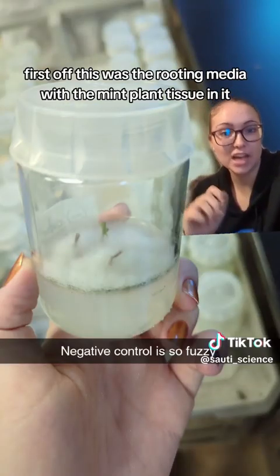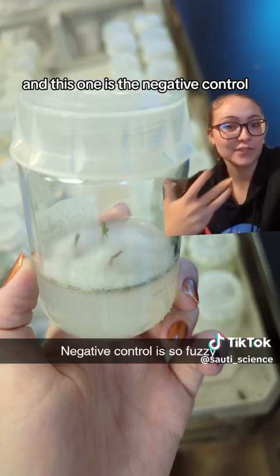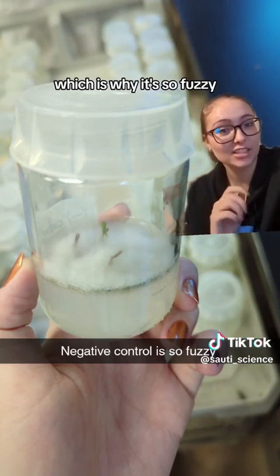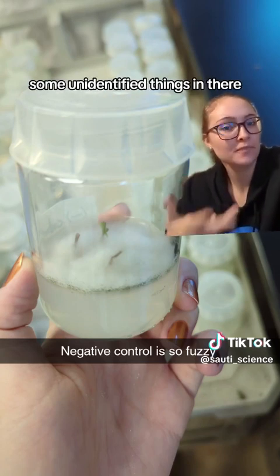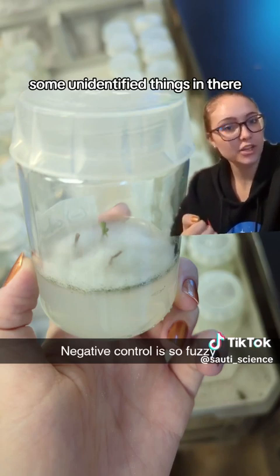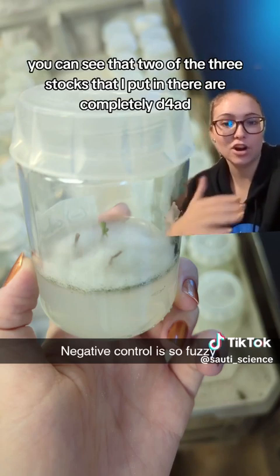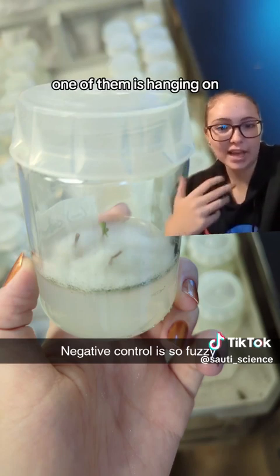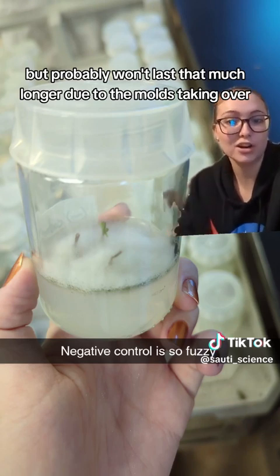First off, this was the rooting media with the mint plant tissue in it, and this one is the negative control — the unsterilized plant tissue — which is why it's so fuzzy. We've got some molds and some unidentified things in there. You can see that two of the three stalks I put in there are completely dead, taken over by the mold. One of them is hanging on, but probably won't last much longer.